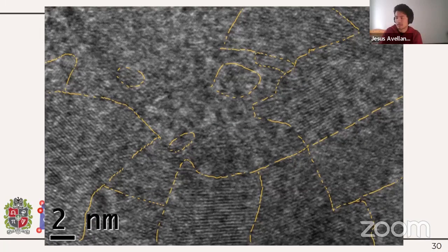From a first glance, we can say that indeed we have some ferromagnetic domains. We can see them in the TEM images, but we also have a really polycrystalline behavior. As you can see, we do not have a homogeneous orientation of all the little crystals. We have some ranges where the magnetization changes, not widely, but it is something that we have to take into consideration if we want to correctly analyze the physics behind these images.